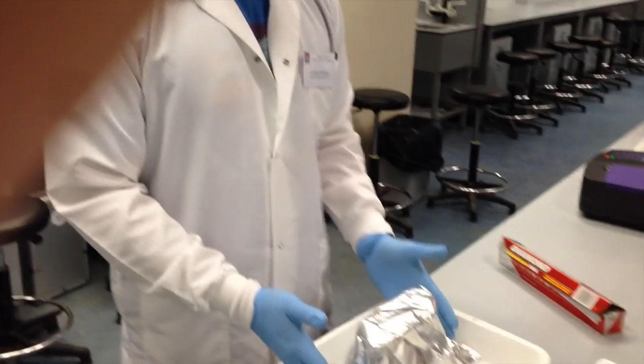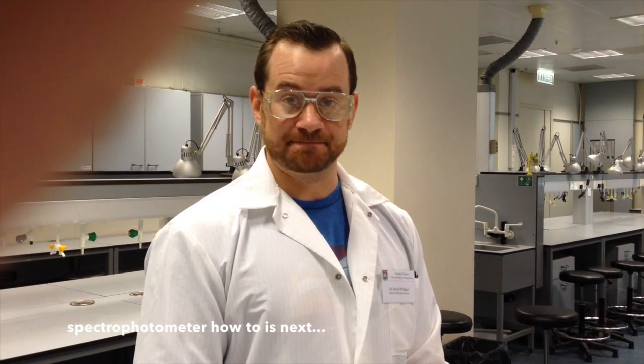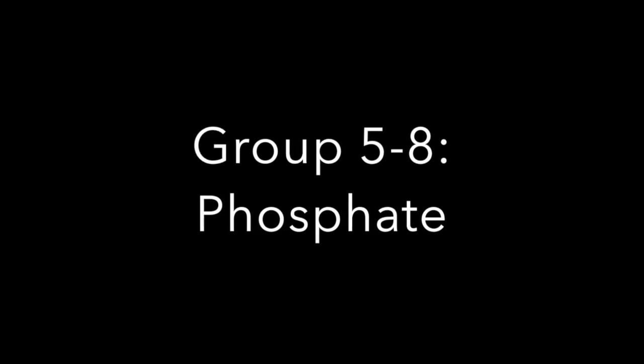So once I have my samples protected from the light, I'm simply going to wait 1 hour until the reaction has come to completion, and then I'll return to the station to analyze my samples using the spectrophotometer. So if you're assigned ammonium for your group, then you can get to this point and then you can move on to one of the next stations to continue to analyze your water samples for other parameters.